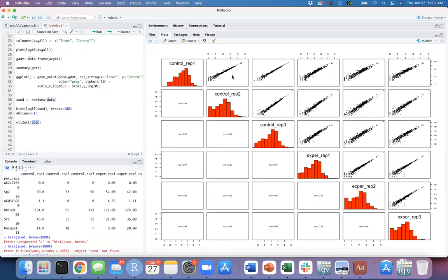So these are scatter plots, the same thing like we created, but for all samples, an all-to-all scatter plot. Here, for example, if you want to compare the controls, these are your controls, so their correlations should be high. These are Spearman correlations. Their correlations are extremely high, 98, 97, 97. It means that your replication is good.